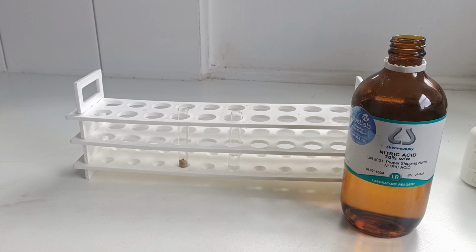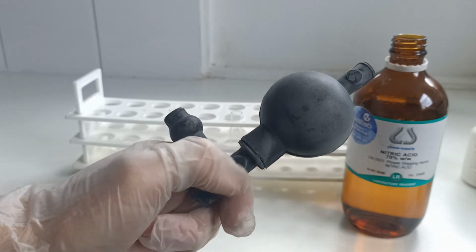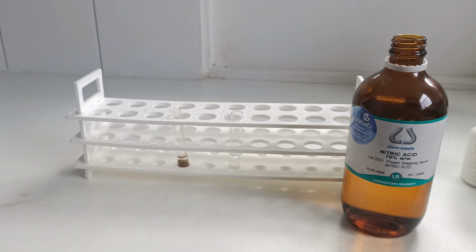Okay, so we'll pipette our nitric acid into our sample. I need a small amount. Yeah, might get a little bit more than that. This would be pipetting. I would recommend you use a pipette bulb rather than your mouth for obvious reasons. Pipette bulbs I'm talking about these things. Squeeze this, a little valve there, and you can very easily control how much liquid you get through your glass pipette. Very handy things, you get them from most lab supplies.